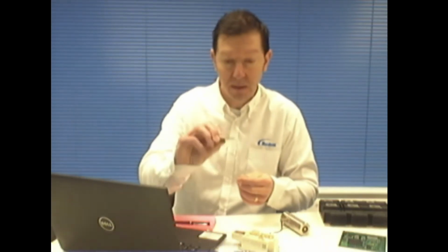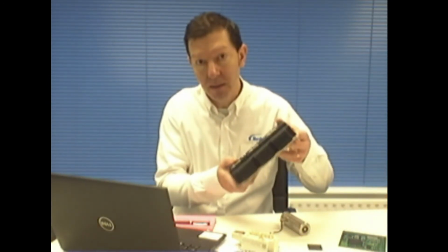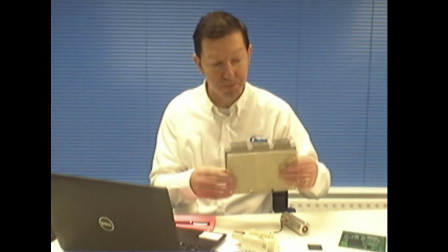In this video, I'm going to briefly explain AMI and its methods of non-destructive analysis. We can use AMI in any microelectronics application looking for delaminations, cracks, voids, differences in material density, anything ranging from BGAs, capacitors, QFNs. But specifically for this video, I have some examples of images inside a power module, an IGBT, and what you can expect to see using ultrasound in a power module.